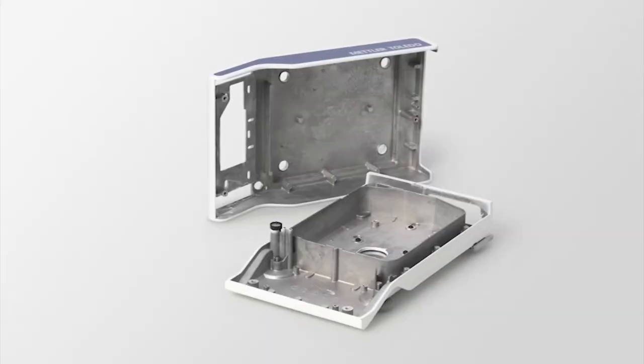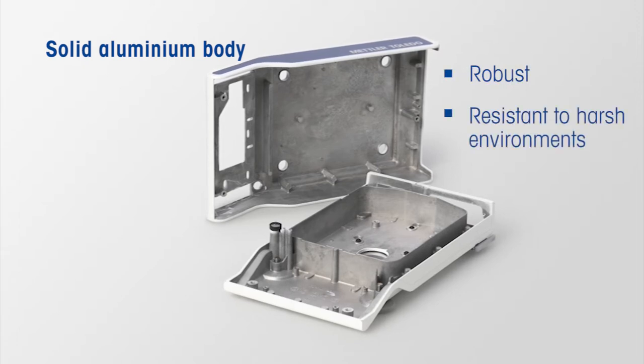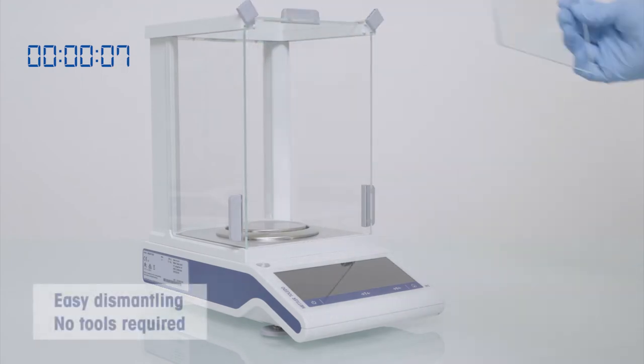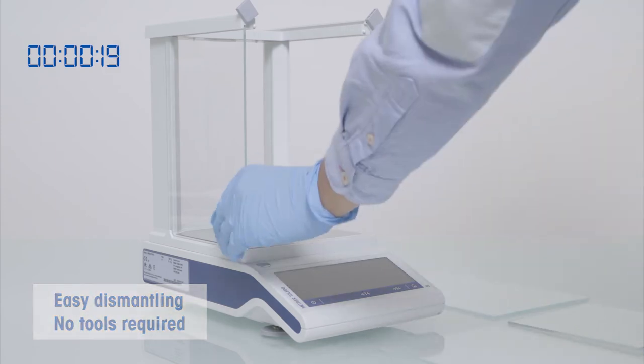The balance housing is made of die-cast aluminum, which gives the balance a robust design and an increased resistance to harsh working conditions. The draft shield of the analytical balance has two quick-lock latches that allow the doors to be dismantled within seconds.